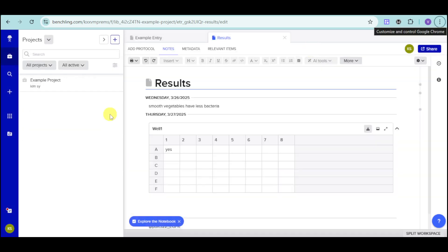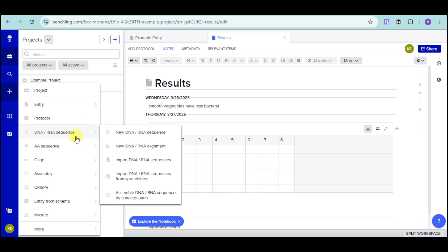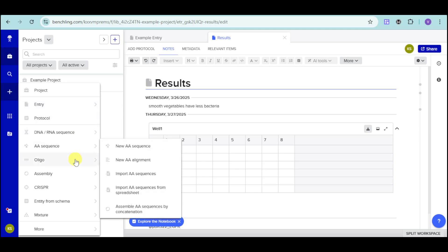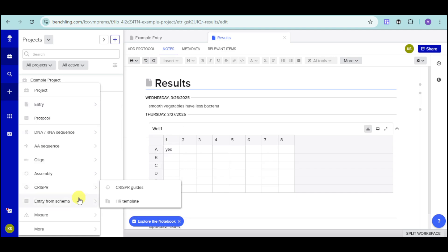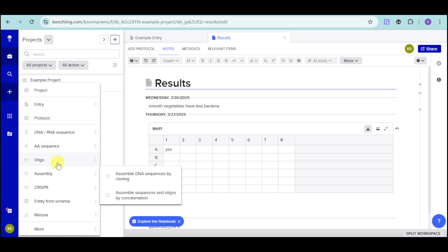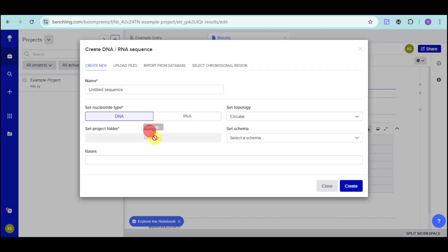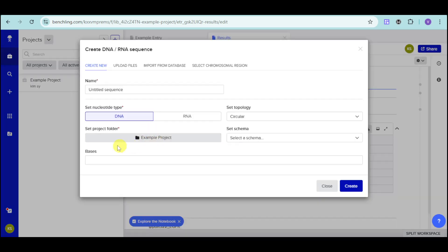What's good with BenchLink is you can also create some particular database and also use some of the advanced tools of biology. You can click on this plus icon or this create icon. And we have here this DNA, RNA sequence, AA sequence, OLIGO. We also have CRISPR as well as some mixture options. We also have more things like templates, folders, and entries. For example, let's choose in here this DNA or RNA sequence. Let's click onto this right here.